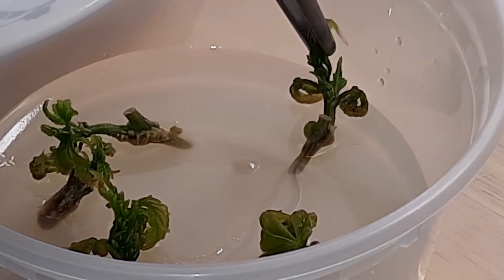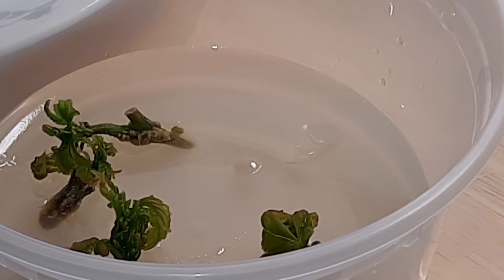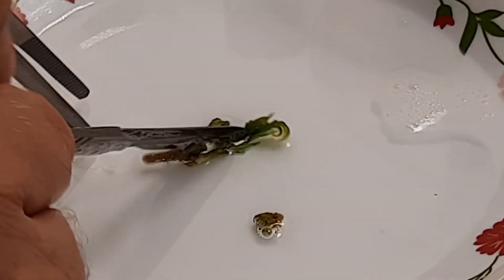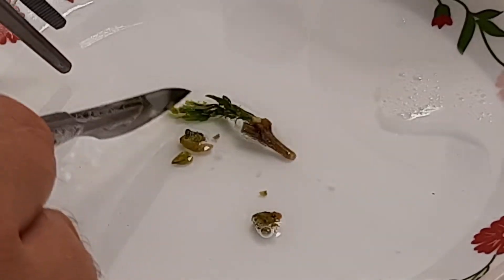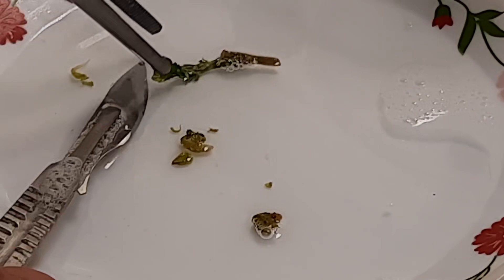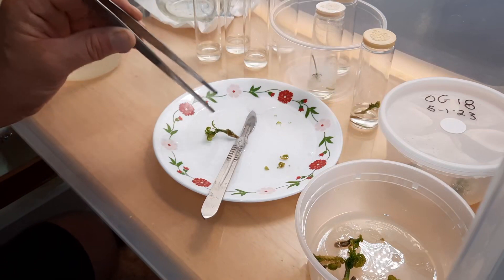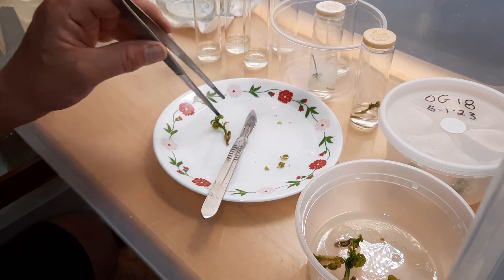I'm just going to grab one of these explants and drop it in this bleach solution like so. It looks pretty good — I'm just going to cut the two brown leaves off of it, the brown leaf tips. Take my forceps, grab one of these clean plants that don't show any contamination, and wash it around in the bleach water.